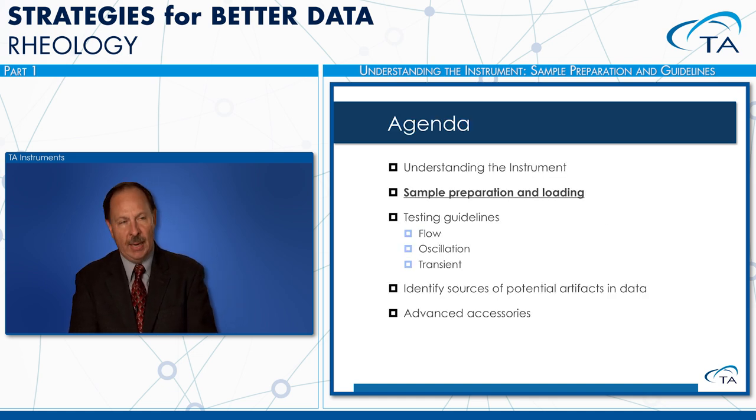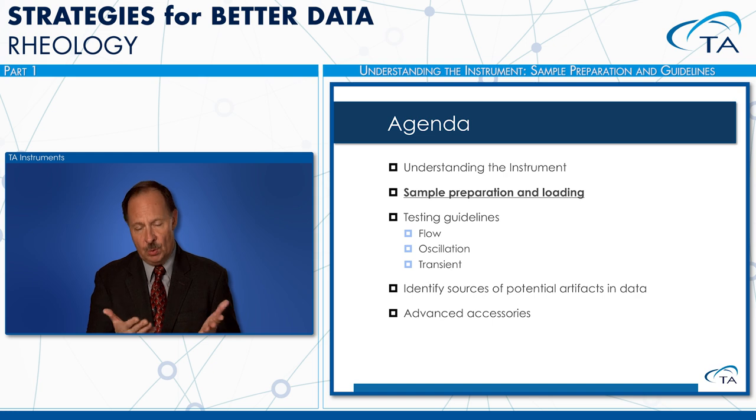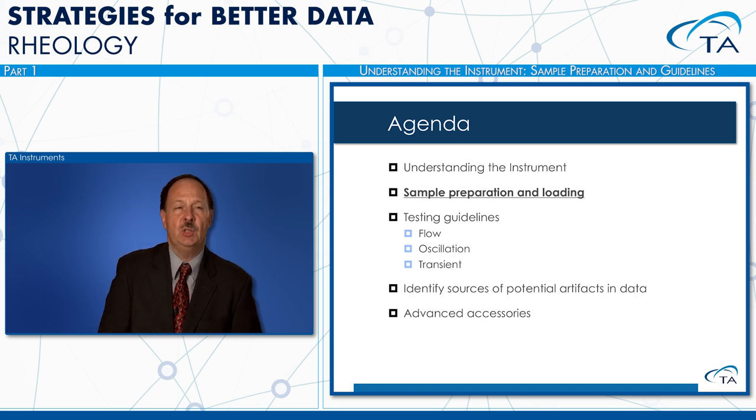In our next section, we will address sample preparation and loading. Now you are familiar with the rheometer itself, and you're aware of the limitations with those parameters I just mentioned. But another very important part of getting good rheological data is to make sure that you've prepared your sample correctly, and then you've loaded it appropriately onto your rheometer, and you've taken precautions to make sure that your material will be stable when you're doing your testing. And sometimes that could be a challenge.